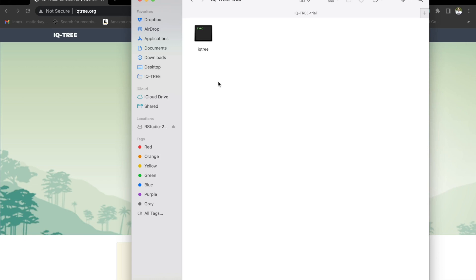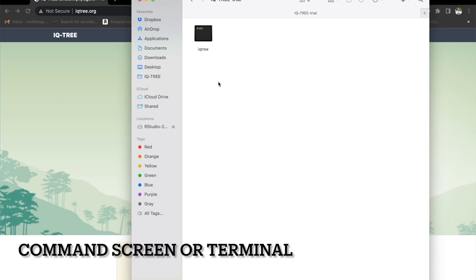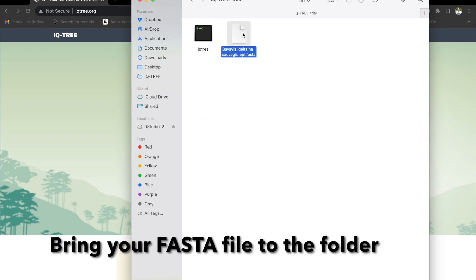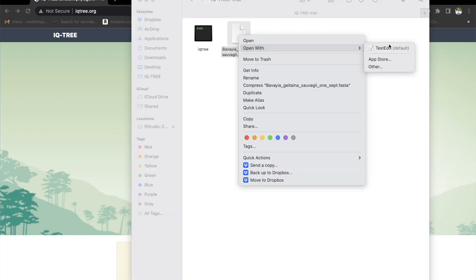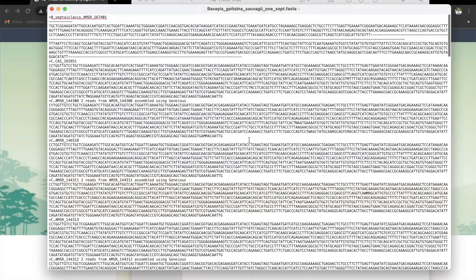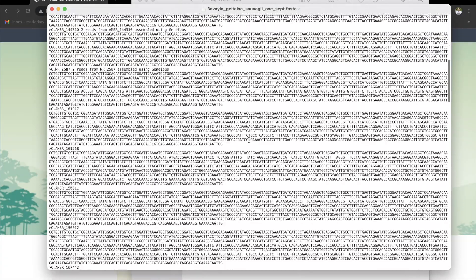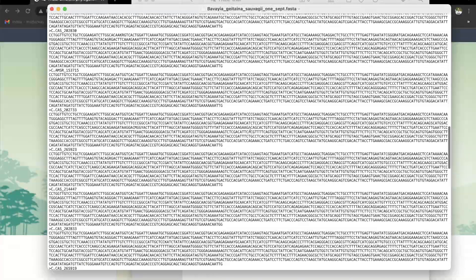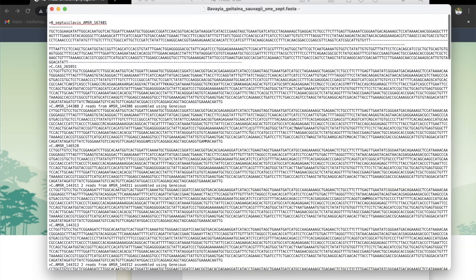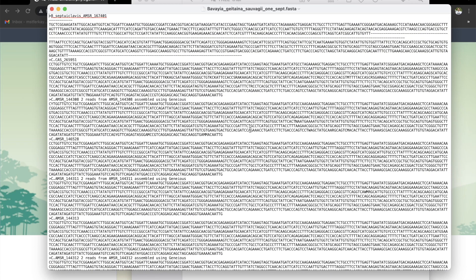This is the file that we're going to open through command. Here's our FASTA file. You can click on open with and find text edit — it's already default for me. As you can see, I have a bunch of sequences. These are all aligned already. If you don't know how to align, click on the description of this video and go to my tutorial on how to align sequences.